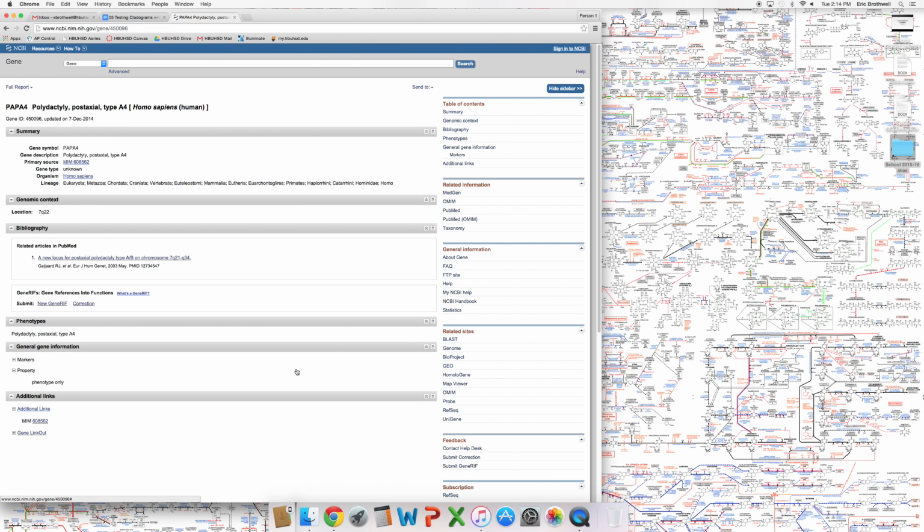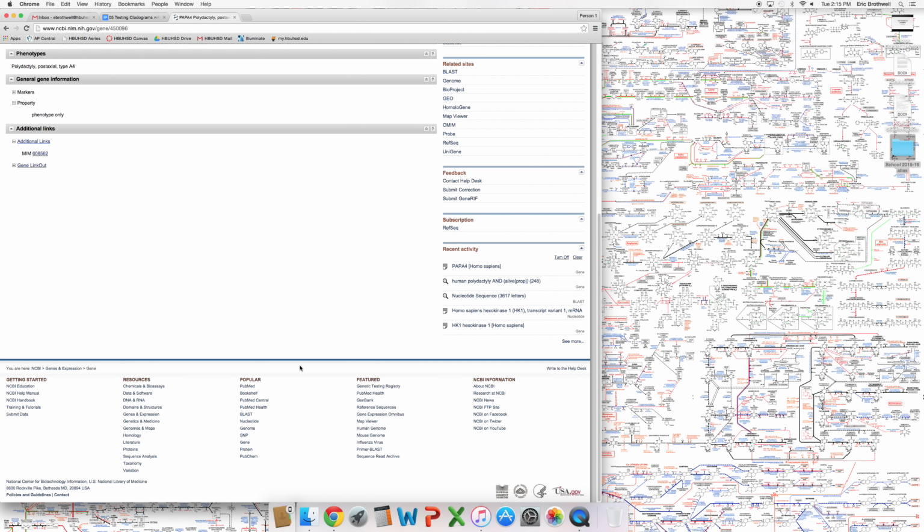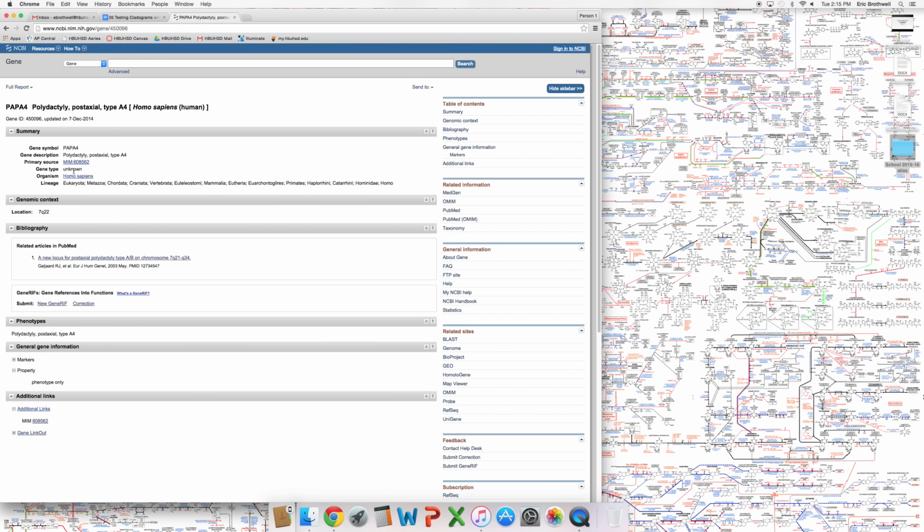And this shows up. What I need to find is a reference sequence. And if we look here, I don't have anything. Gene type, it says unknown. This bit here where it says lineage, this is telling you the domain, and then we have animal. Then we were talking about, oh, what type of animal you are. Then we have a chordate, which is a phylum, and blah, blah, blah, until eventually you get to genus of Homo. So needless to say, we can go through a whole lot of junk here explaining where we are, but we don't have a gene. What that tells me is, I chose poorly, let's try again.